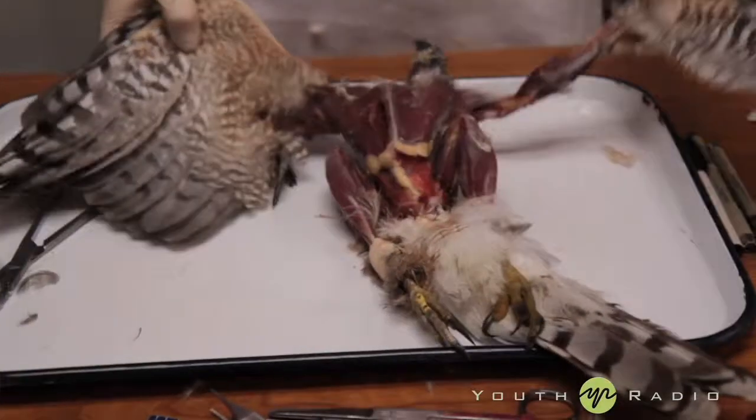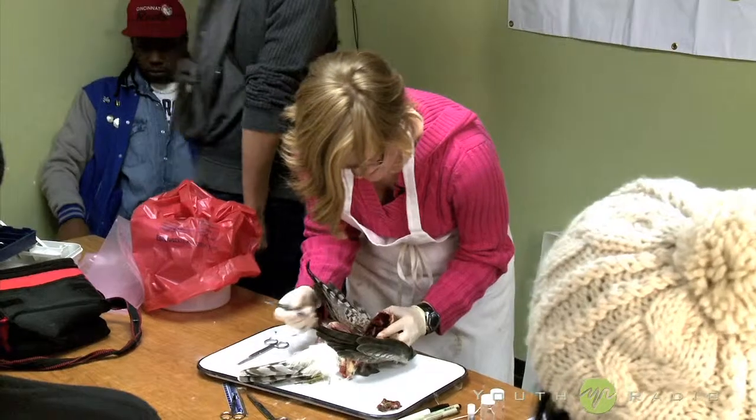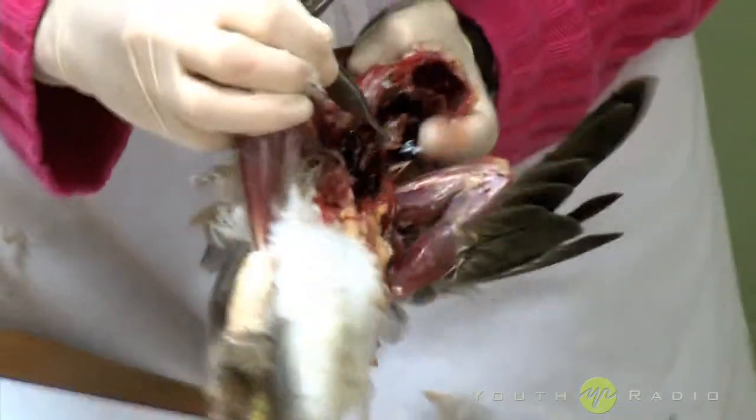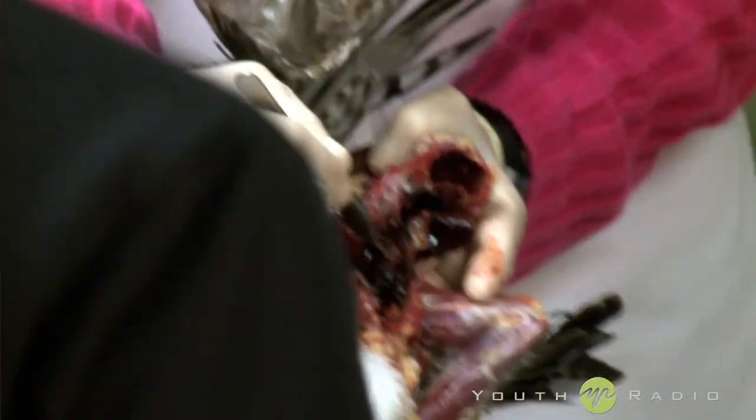I'm gonna remove the skin. We're gonna open it up and identify the sex of the bird. I can tell you right now it's a female. You see that thing that looks like a bunch of grapes? See that? That's an ovary. Those are eggs.